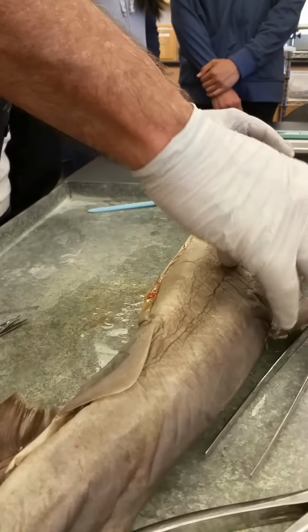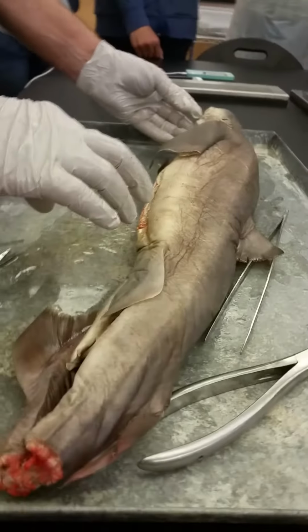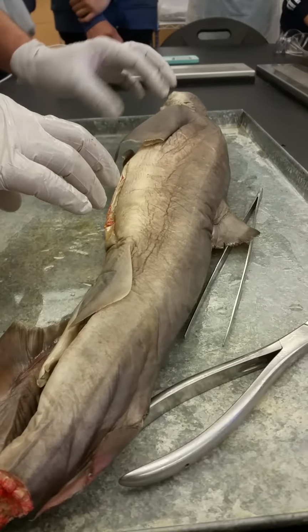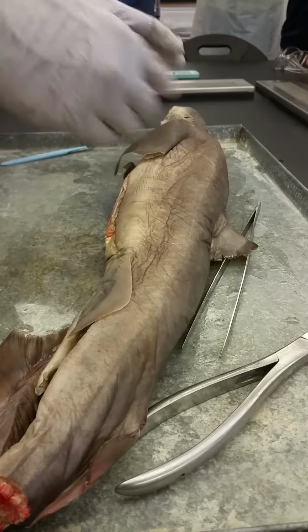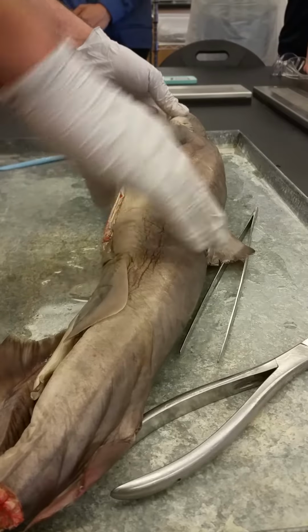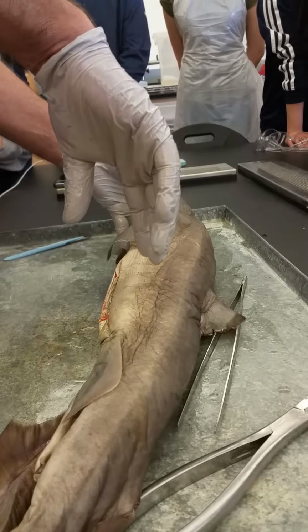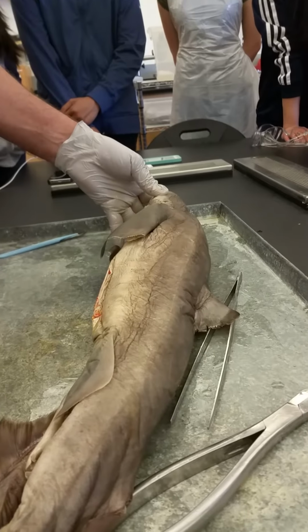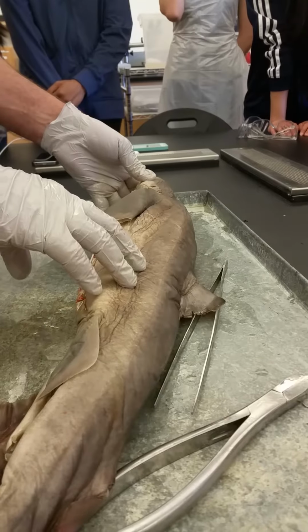Or if they're biting something, not only have they got the lateral line system, but the ampullae of Lorenzini. They can feel the electrical field of anything trying to swim away. Also, your skin is a really good insulator. You get a cut in your skin, you're leaking ions. They can pick out a wounded fish because that's the one leaking ions, by detecting the electric field.